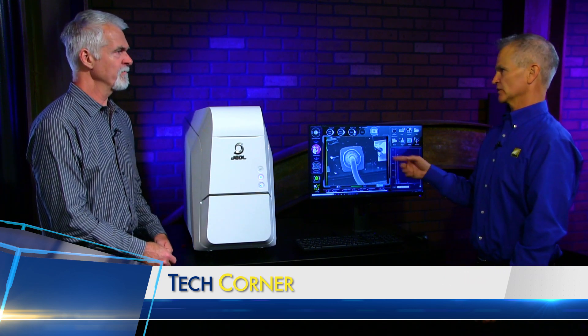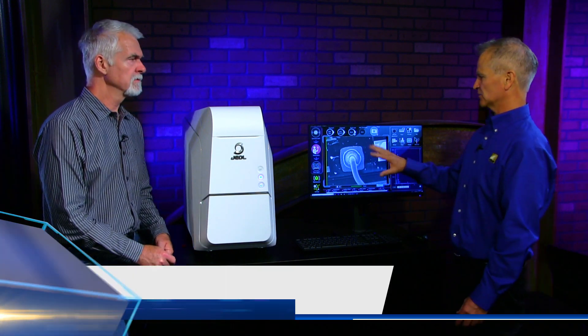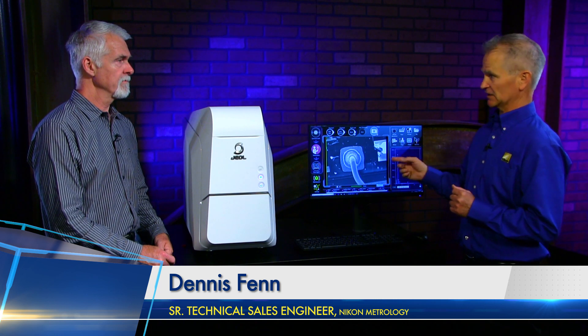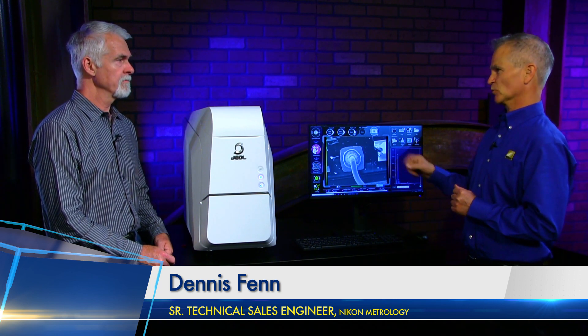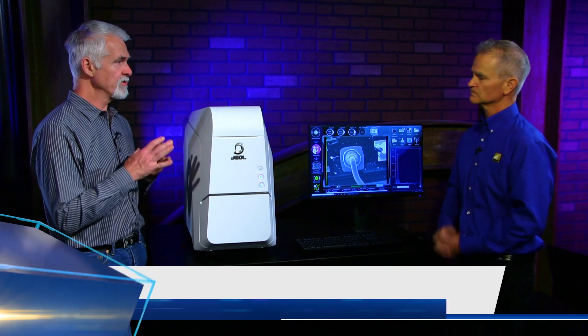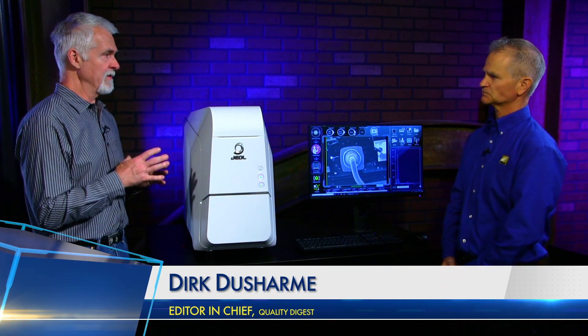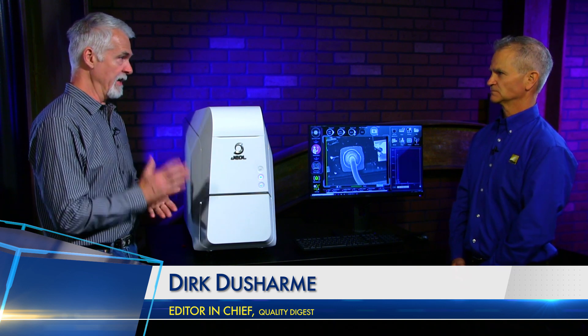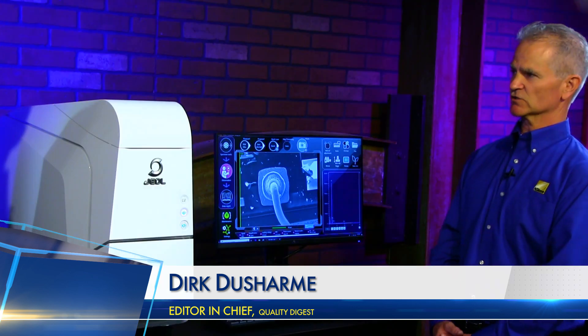It's a raster scan — called the live scan here. It'll be a little bit more grainy because you are scanning an electron beam. If you had it at the highest resolution, it would be scanning a lot slower, which makes it a little bit more difficult to focus and adjust your sample. So you use that first pass just to kind of see where you're at, and then you capture the high-resolution image.